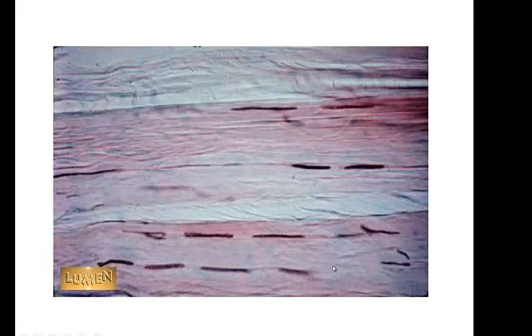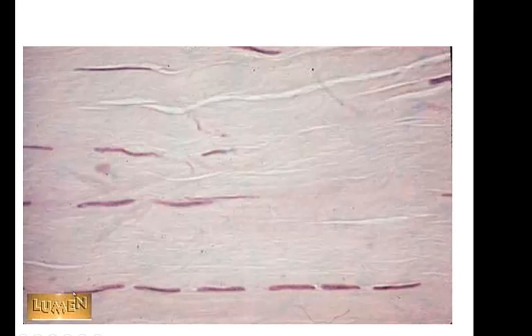But these are the fibroblast nuclei, all in a row. So I hope you believe me by now. You're like, yep, she's telling the truth. Slit-like fibroblast. These are the collagen fibers here. This must be a ligament or a tendon, and the purpose is to resist pulling in one direction.